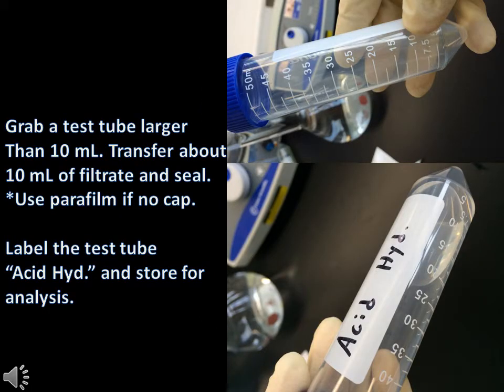Grab a test tube that is larger than 10ml and transfer about 10ml of the filtrate to the test tube and seal it. If there is no cap, use parafilm. Grab a marker and label the test tube 'acid hydrolysis' and store later for your analysis.